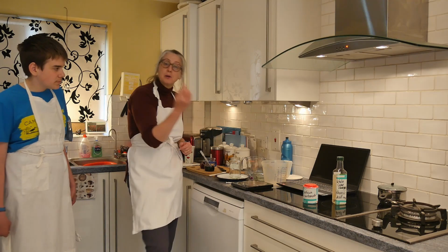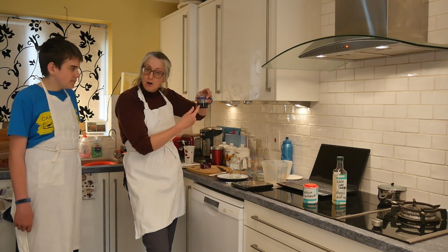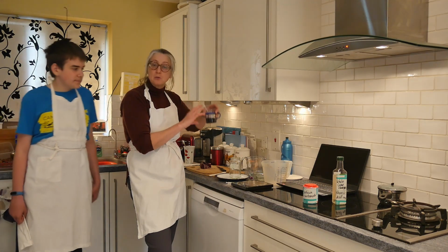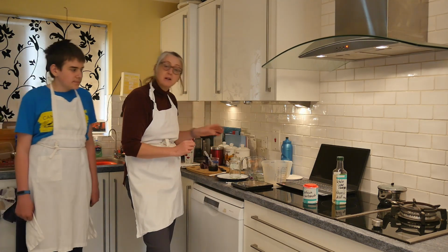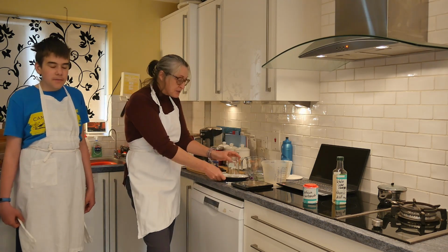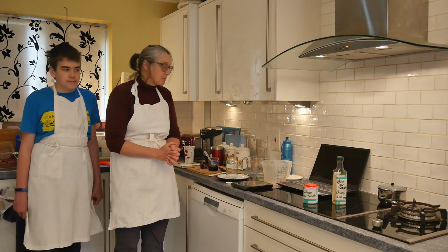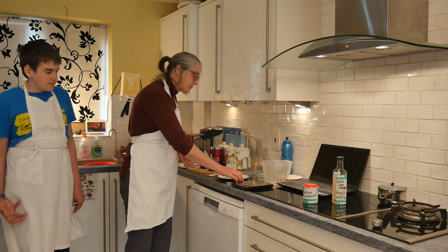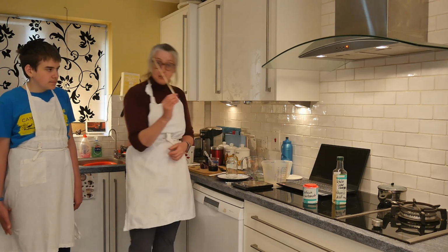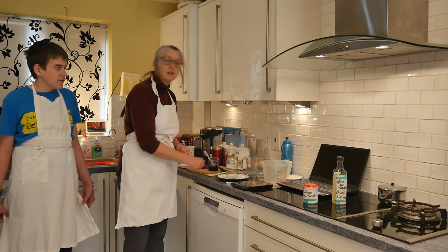Other things: careful measuring with your syringe of your indicator solution, because we only need very small volumes of that. A mixing jar, and something white to put your mixing jar onto. Okay, so we've got that. Oh, and of course, a stirring stick, in case you decide you need to have a stirring stick.